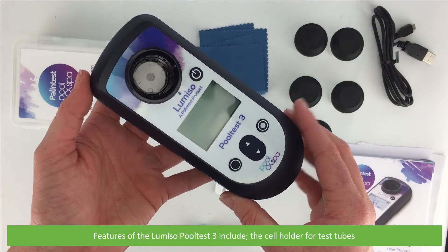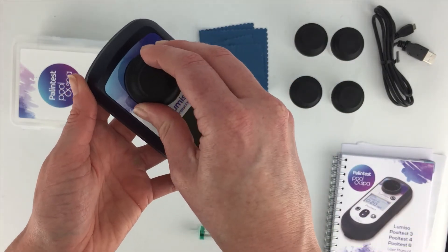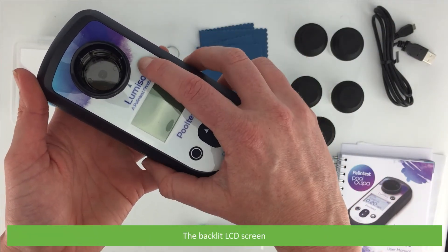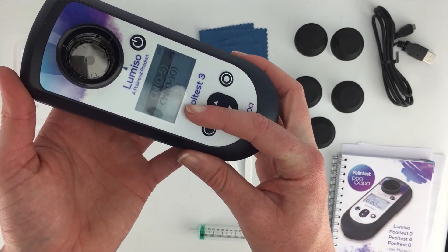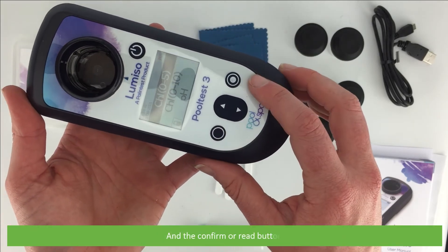Features of the Pool Test 3 include the cell holder for the test tubes, the on/off button, the backlit LCD screen, the back or blank button, menu and scroll keys, and the confirm or read button.